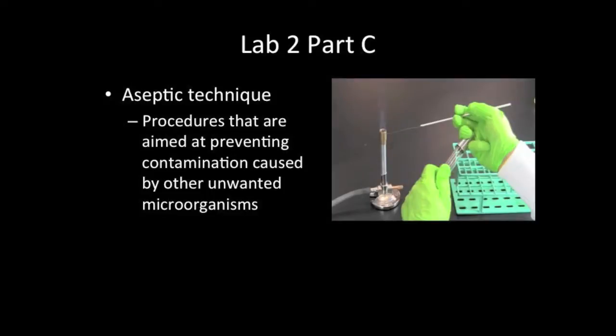Working with microorganisms is somewhat different than working with other organisms. It is different because we cannot see them with our naked eye, and they are ubiquitous. The term ubiquitous means everywhere. And trust me, microorganisms are everywhere. They are in our soil, water, air, dust, food, and they live in us and on us even when we are healthy. So when we are working with bacteria, we have to take the necessary precautions to exclude unwanted microbes from our samples. In order to keep unwanted microbes from our samples, we utilize specific aseptic techniques. An additional video will be included that discusses aseptic technique.